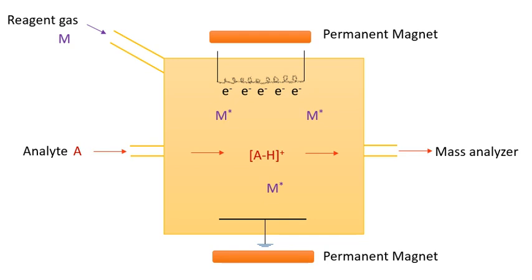The analyte is a gas or liquid spray, and ionization is accomplished using an atmospheric pressure corona discharge. This ionization method is often coupled with high-performance liquid chromatography, where the mobile phase containing eluting analyte is sprayed with high flow rates of nitrogen or helium, and the aerosol spray is subjected to a corona discharge to create ions. It is applicable to relatively less polar and thermally less stable compounds.